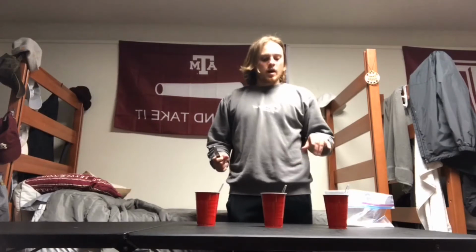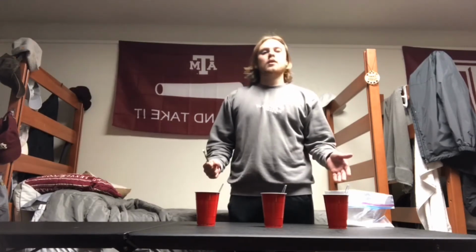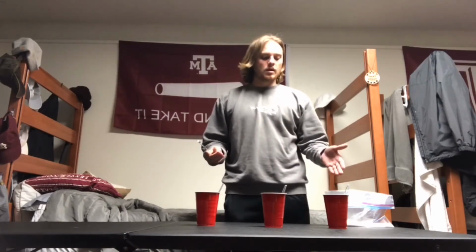I will be testing the solubility of 3 different waters. I have the water from my dorm faucet, water from the dorm hallway water fountain, and water from a water bottle from the store. I'm assuming that these are going to be of 3 different purities, with the one from the faucet being the least, and the one from the water bottle being the most pure.